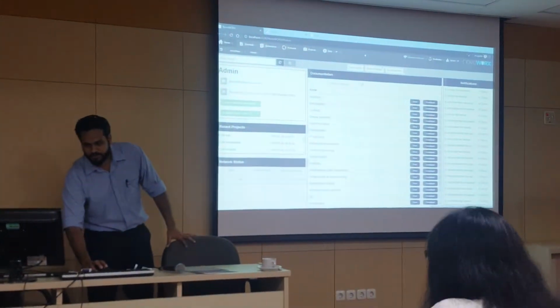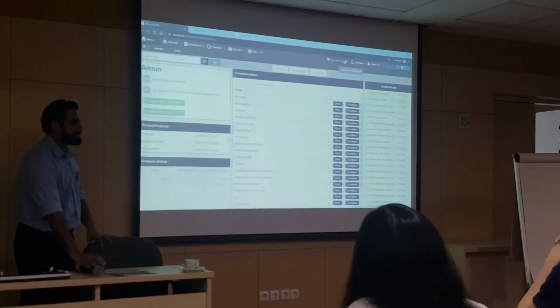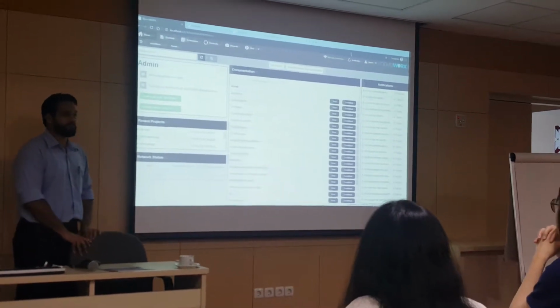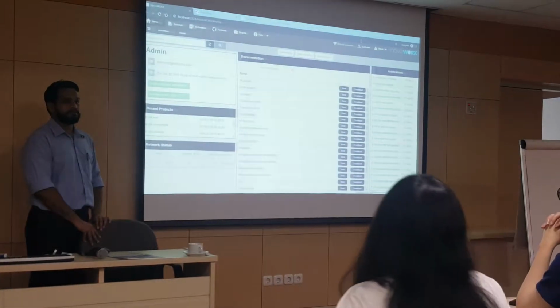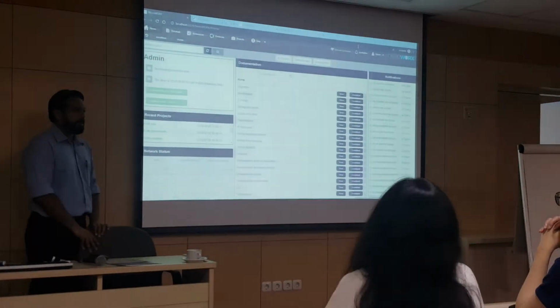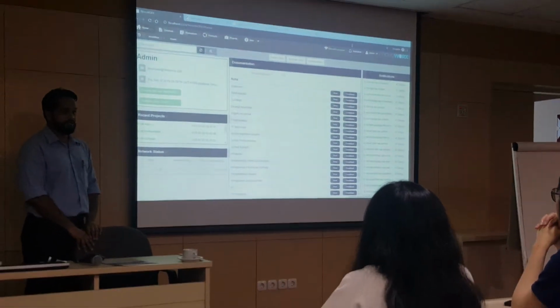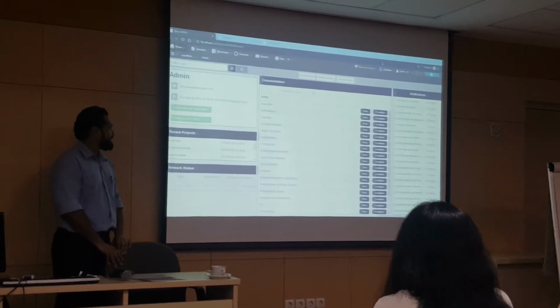So this is novoWorx right out of the box. What we have is a web browser-based system. It runs on most supported web browsers, Google Chrome, Firefox. We've tested it on Internet Explorer. Opera, Safari, we've not really done much testing, but we know it runs. If there's any problem, we don't really know what's going on yet.